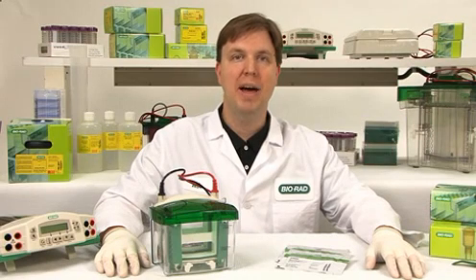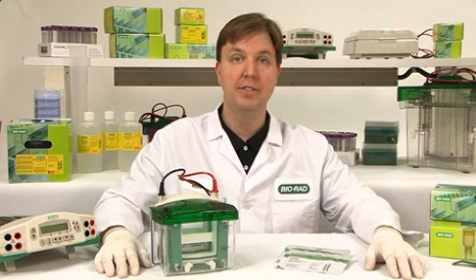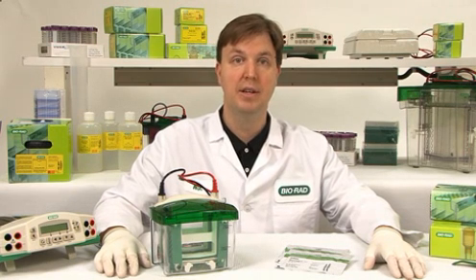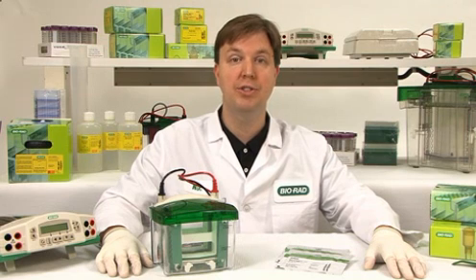Hi, I'm Nick Schmiel from BiRad Laboratories and I'm pleased to introduce you to the Mini-Protein TGX precast gels. These gels provide high quality resolution using the Lamley buffer system with an extended shelf life of 12 months. The cassettes have been designed for fast setup based on feedback from researchers like you.